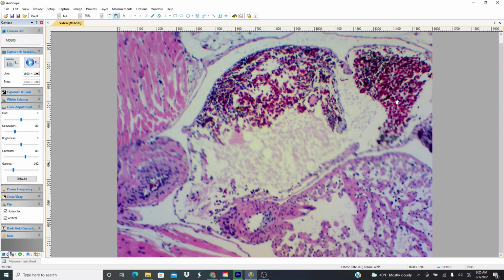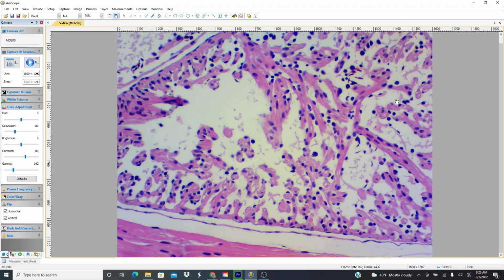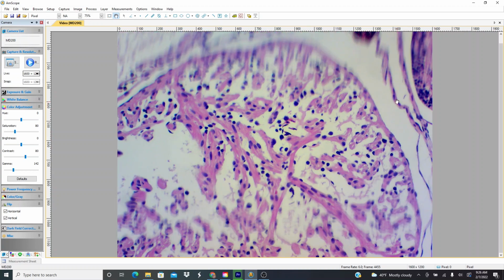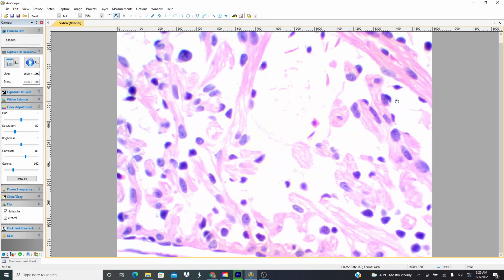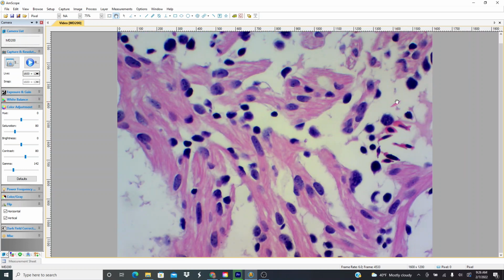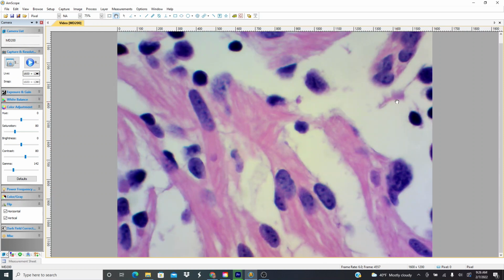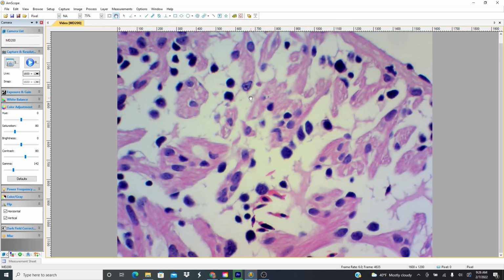Now, I think this is very interesting here. This definitely has to be the heart. Sort of oval shaped thing, and looking at it, you can see these little fibers, these are heart muscle fibers. You should be able to see a pattern in some of this stuff called cross banding. Very interesting.